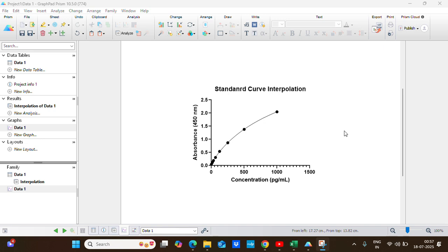In this video I'm going to show you how to interpolate a standard curve to find the unknown concentration by using GraphPad Prism.